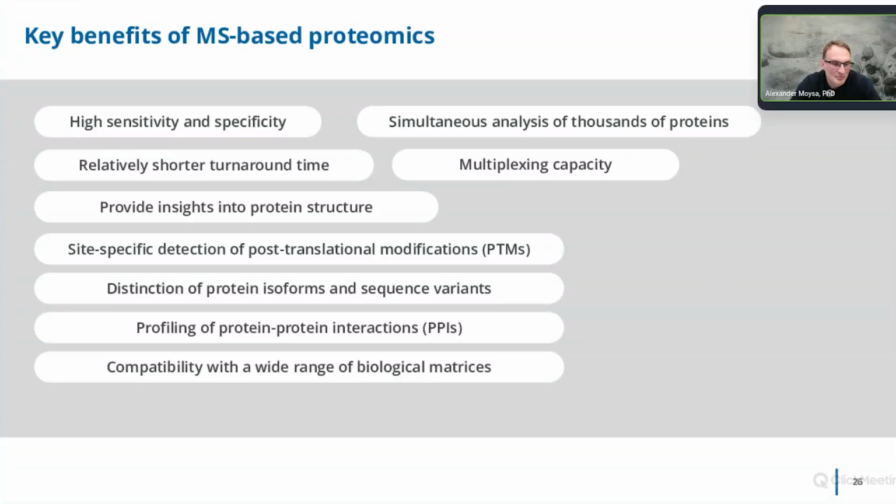Mass spectrometry-based proteomics provides a unique capability for in-depth characterization of proteins in complex samples, increasing the likelihood of identifying meaningful biological signals through the drug discovery process and enhancing the safety of protein biologics through comprehensive characterization.